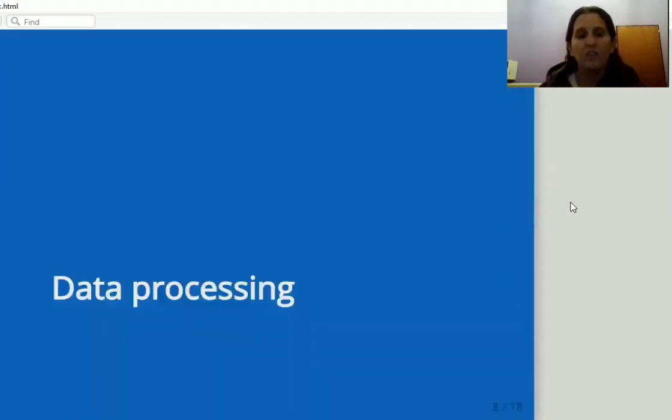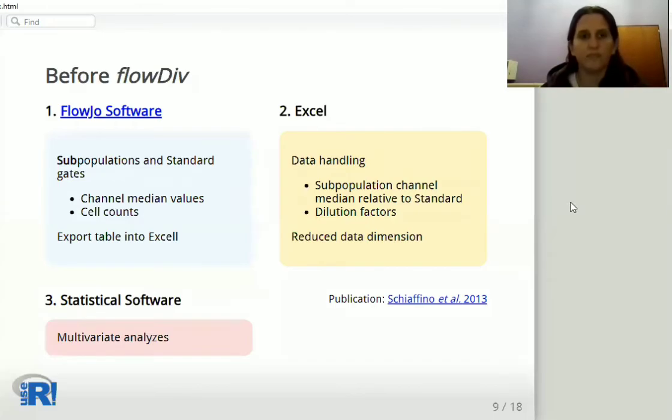Regarding data processing before FlowDiv, we generated gates for the subpopulations and the standard in the FlowJo software.